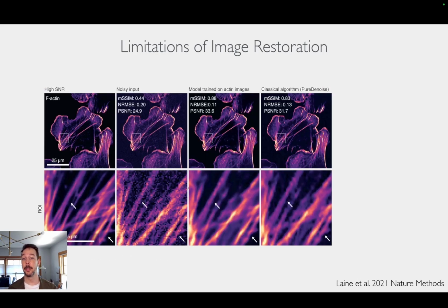And finally, I just want to touch on a word of caution. Whenever we're applying these deep learning techniques to our images, we're training them with paired images. And so the networks are very powerful because they have a lot of information about what's happening in the image. So they perform much better than just deconvolution because they understand the noise, and they understand the features that are in the image. But because of that, they also have a limitation. They've learned features in an image.